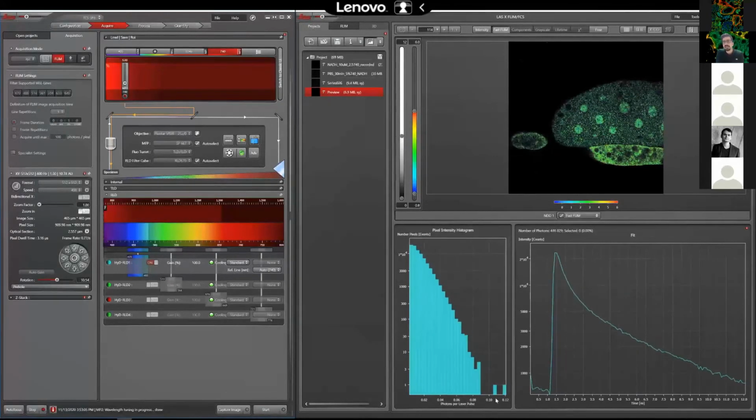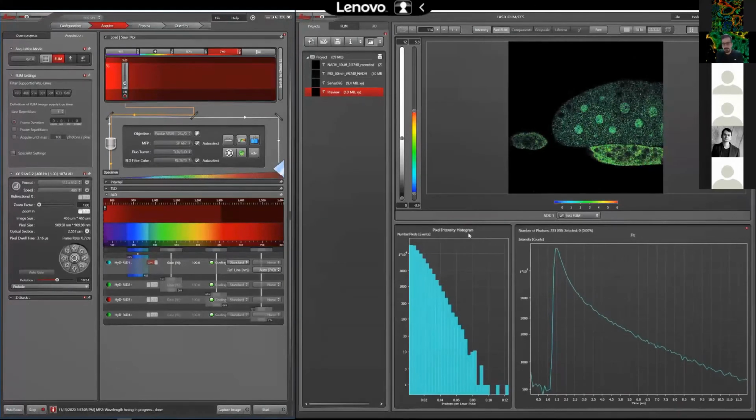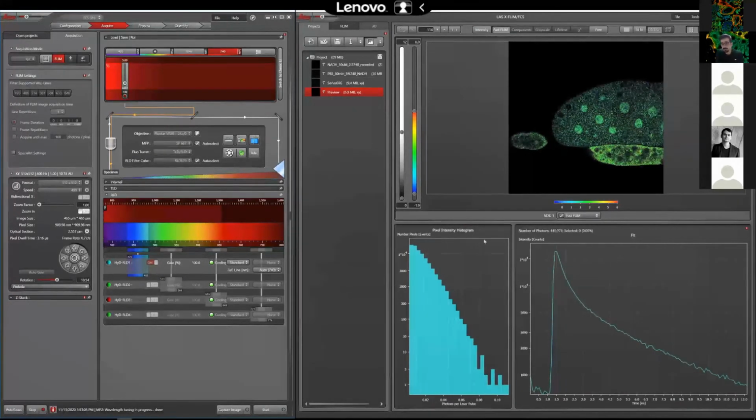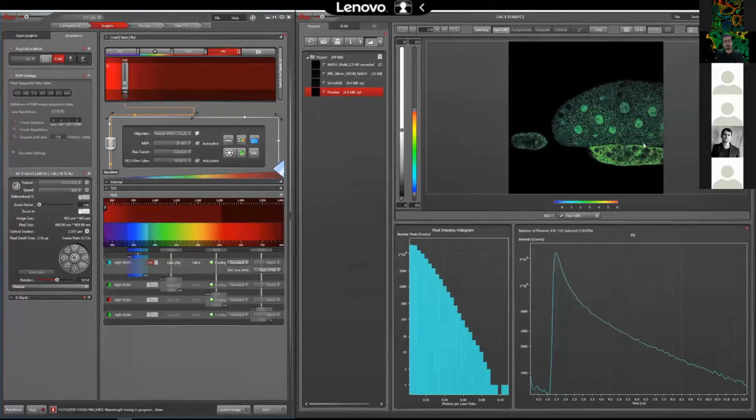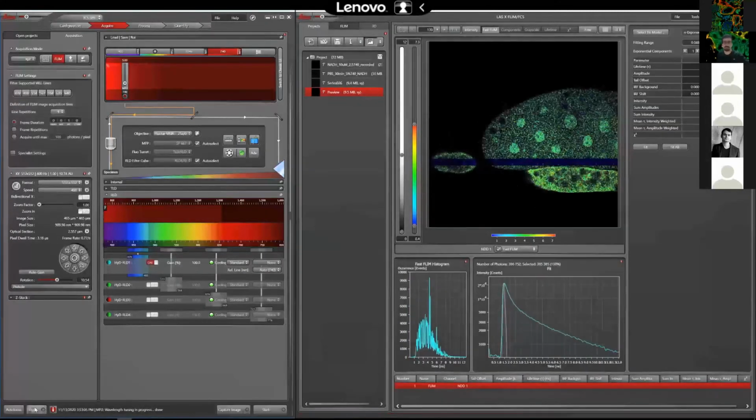So the last measurement we did in the lab for the laser power, at the maximum output of the laser just on the back side of the objective, before the objective, was about 380 milliwatts. Sounds a little bit low. We need to repeat it, but we are using 5% of that maximum output. So this is what I did.